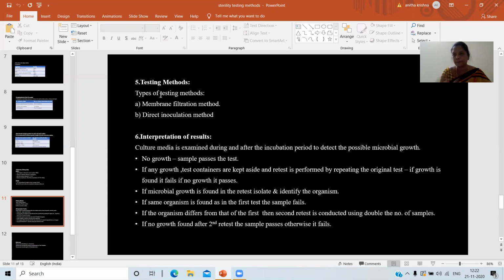And in case of disposables like syringes, band-aids, cotton swabs and different things, if they contain a single batch or a multiple stock batch, then you have to take 2 to 3 numbers from that. If it is a single one, you have to directly put it.